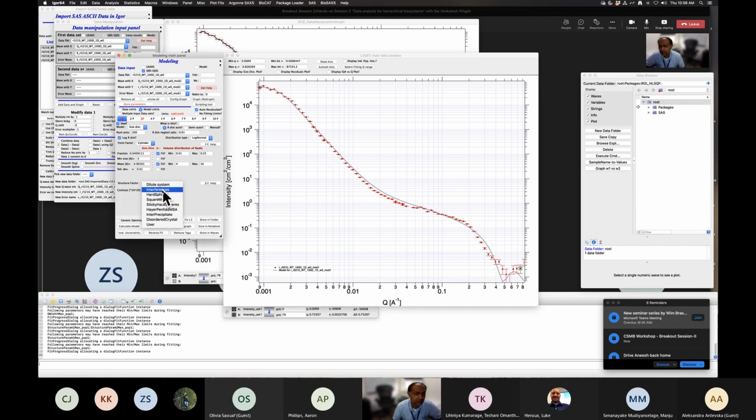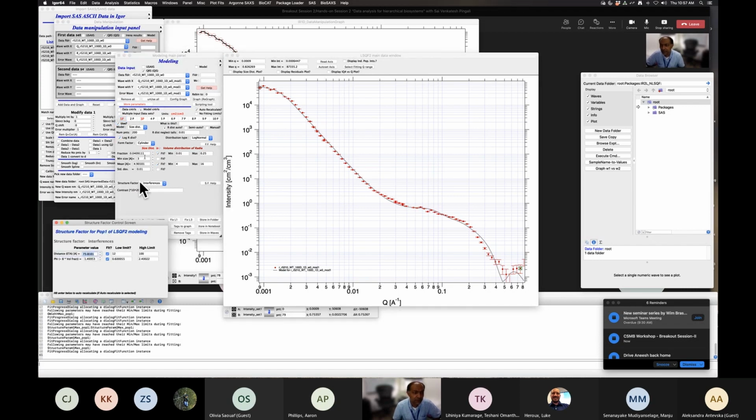So what happened? I would go back to roughly the size of your cylinder. That's about 10 angstroms. So I would say maybe 20, come back to that, and about 1. This volume fraction of about 5 or 6 is closer to cubic phase order. We are not there because we don't see diffraction peaks. So anywhere between 1 to 2 is what I would expect for the volume fraction. So I'm going to force these for now not to vary, and then fit.